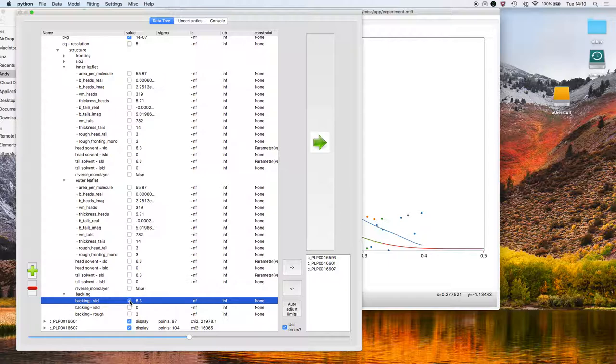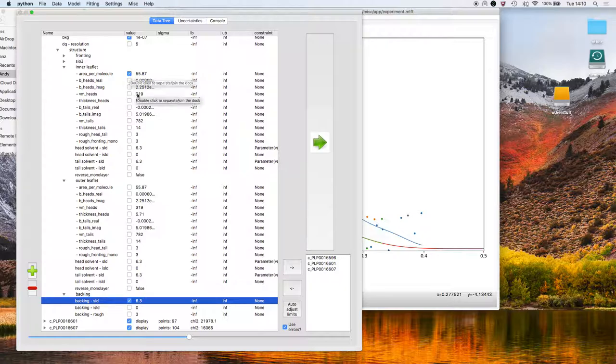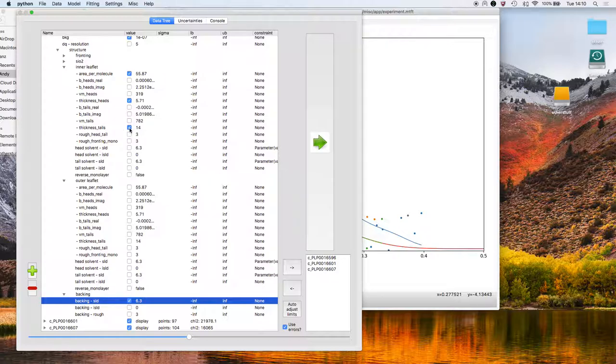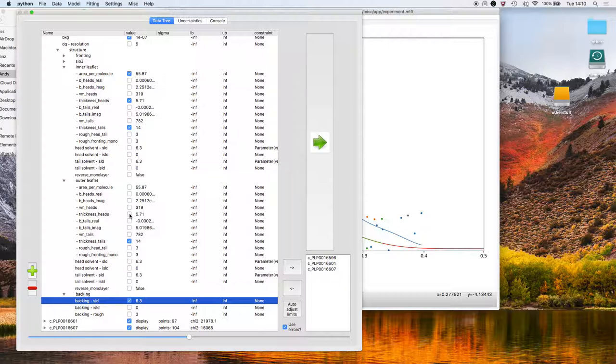I might want to fit the SLD of the backing medium, fit the area per molecule of the lipid. The thickness of the inner head region, the thickness of the inner tail region will fit. And we'll do the same for the outer leaflet as well.